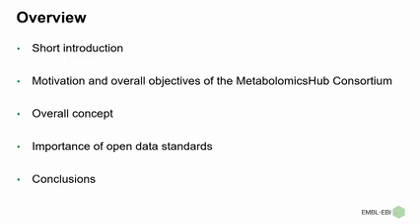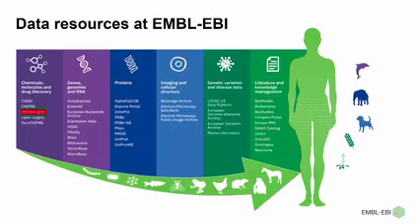So I'm going to start with a short introduction about ourselves. Then I will talk about motivation and overall objectives of the Metabolomics Hub Consortium. I will explain the overall concept. I will give a primer about the importance of open data standards. And then I'll finish with just one slide devoted to conclusions.